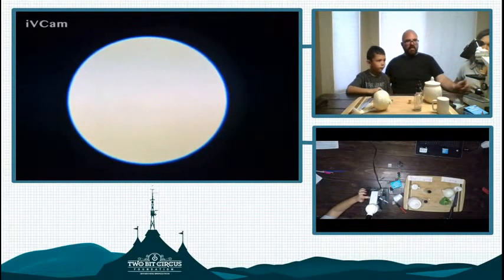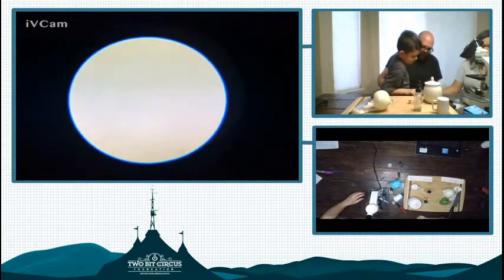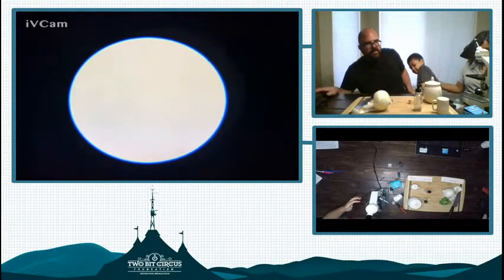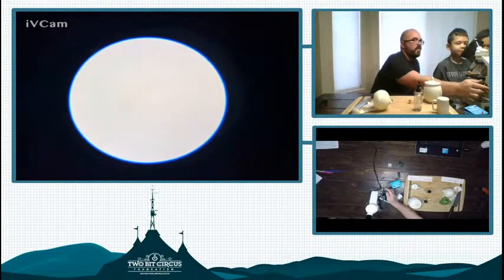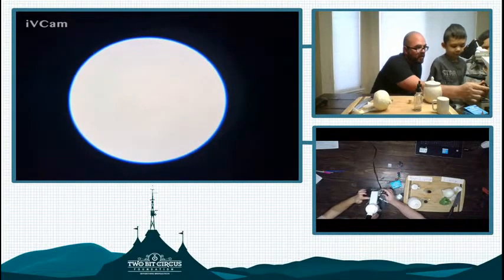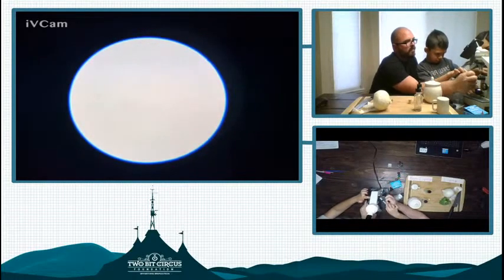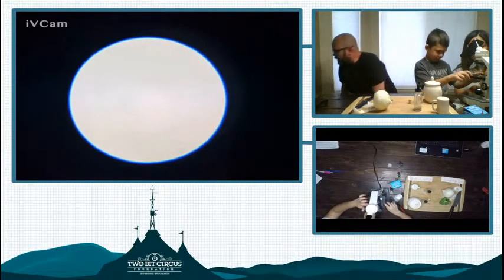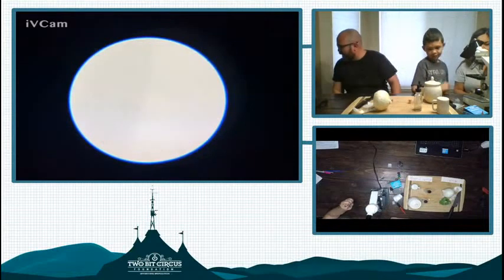Let Robert do that. Come over here and you can change the coarse focus on the microscope. Have a seat this way. And then you're gonna move this back and forth. So I lowered the stage. The clips are there to secure the slide so it doesn't move. Okay, let's make sure.